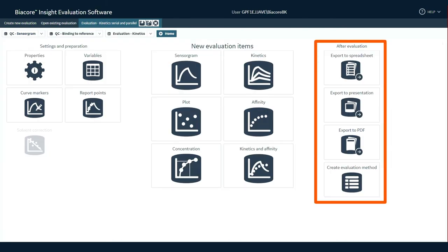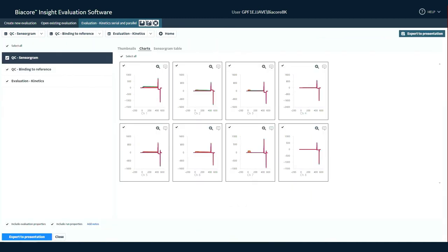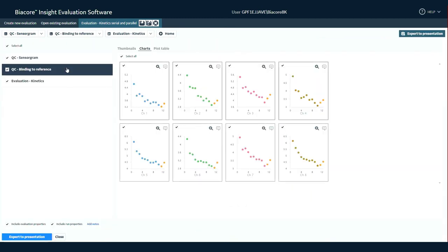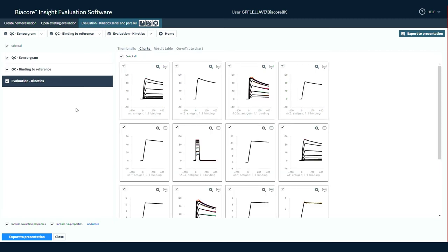Exporting features allow a direct link between your valuable SPR data and internal record-keeping, simplifying figure preparation and transfer to your electronic lab notebook or internal database.